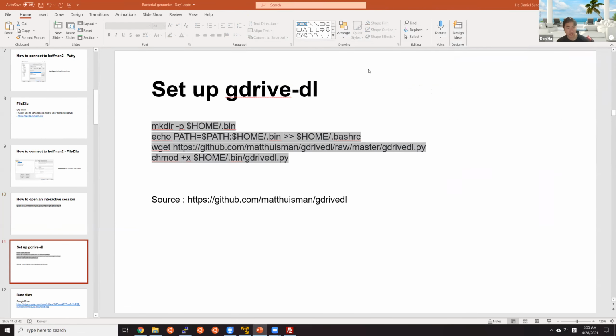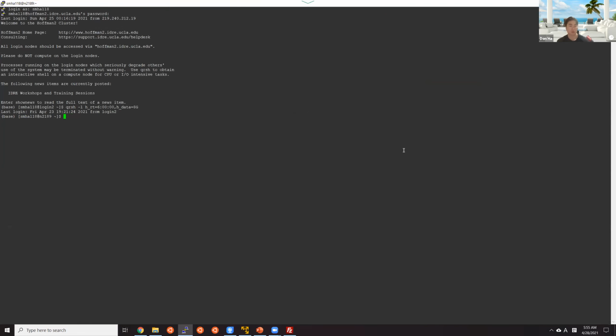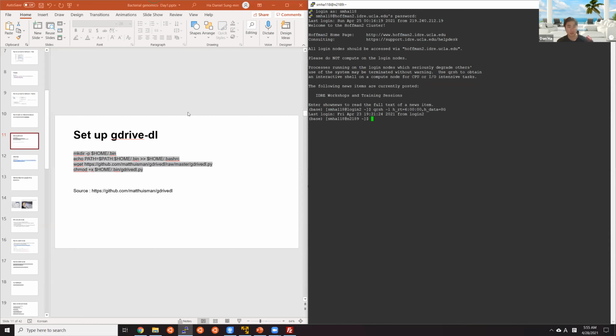Next, you need to download the data. So let's go ahead and make a directory for our workshop.